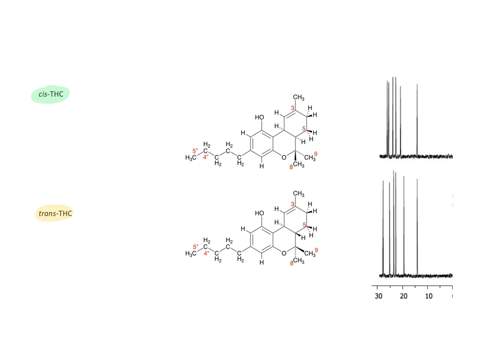We can now analyze the carbons that are most shielded in the spectra. There are 6 of these carbons apparent in both diastereomers, and by focusing on just 6 resonances, we can see similarities and differences.